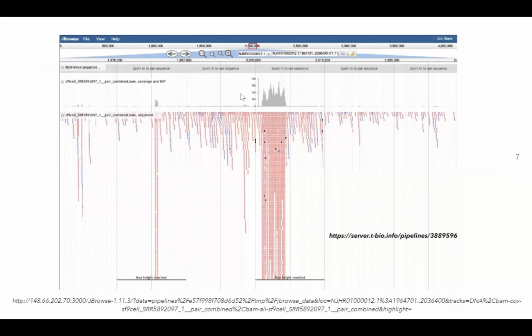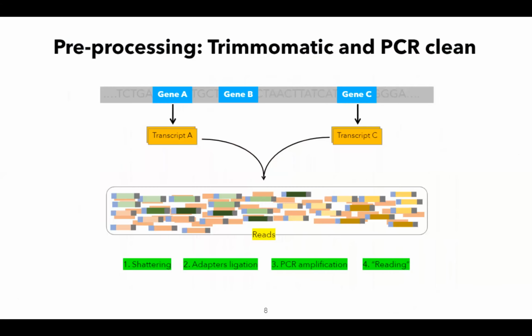It shows the abundance of the reads that are mapped to that particular read. So that's how we're going to say whether our reads are in abundance or if they are in less. So that's how we're going to figure that out. This is all there in the recordings of the previous sections and in transcriptomics 1.